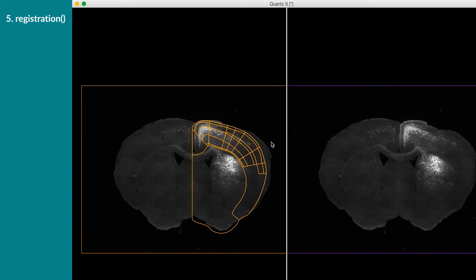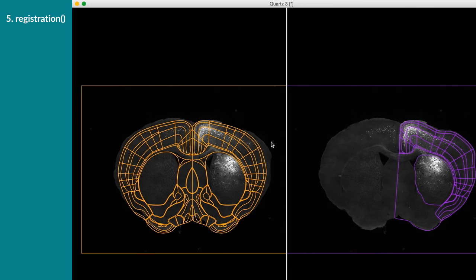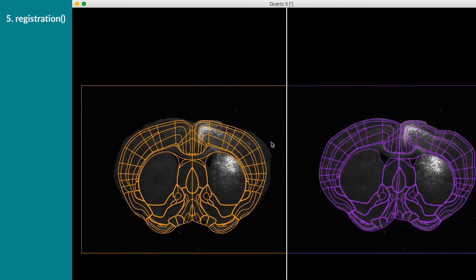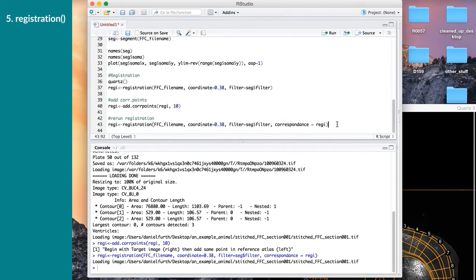So now it always plots first to the left here. The atlas looks the same. It hasn't changed, because we haven't changed the segmentation parameter, but here you will notice a little bit of difference in the ventricles, right? They fit better with the object, and you can see here now we have new correspondence points, the points that are about 32, 33 to what is it, like 42. So we also maybe want to change some correspondence, like 17, which was not in the midline.